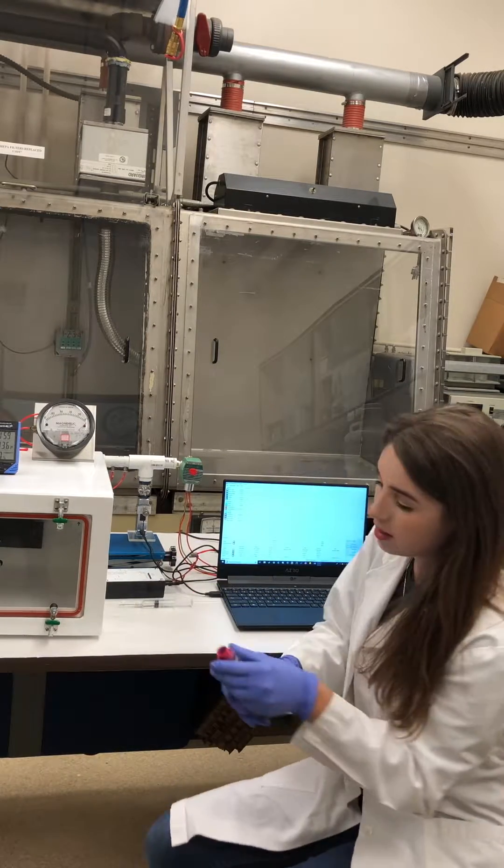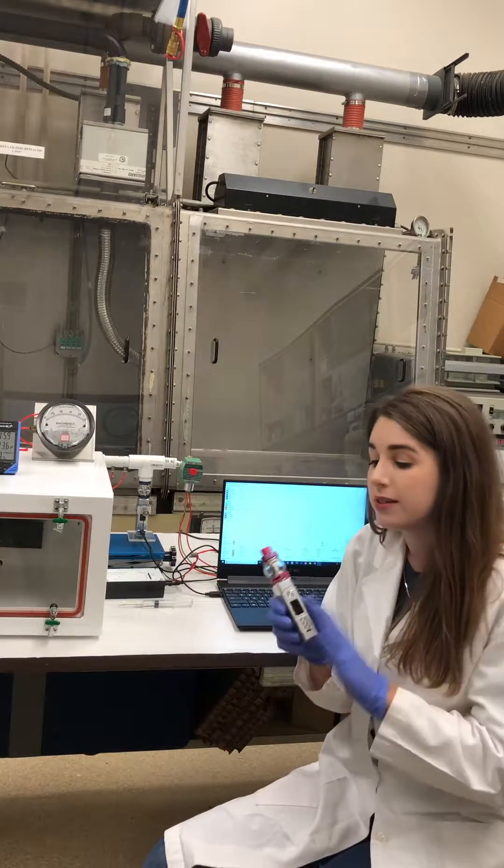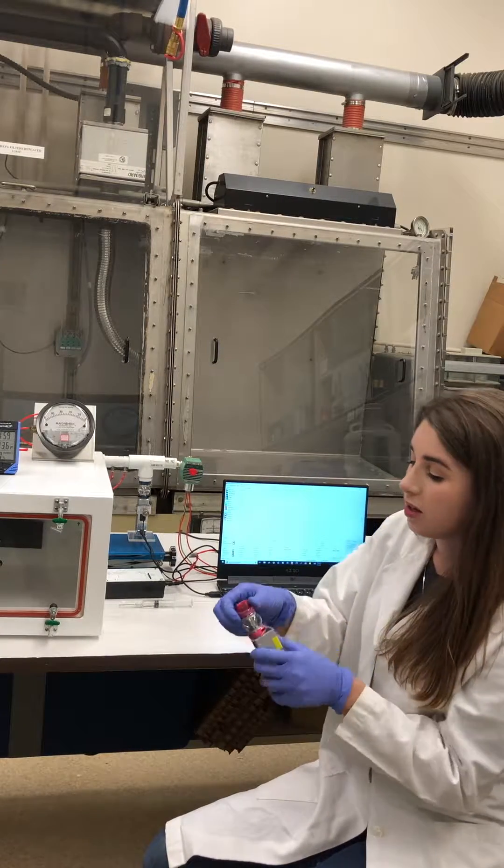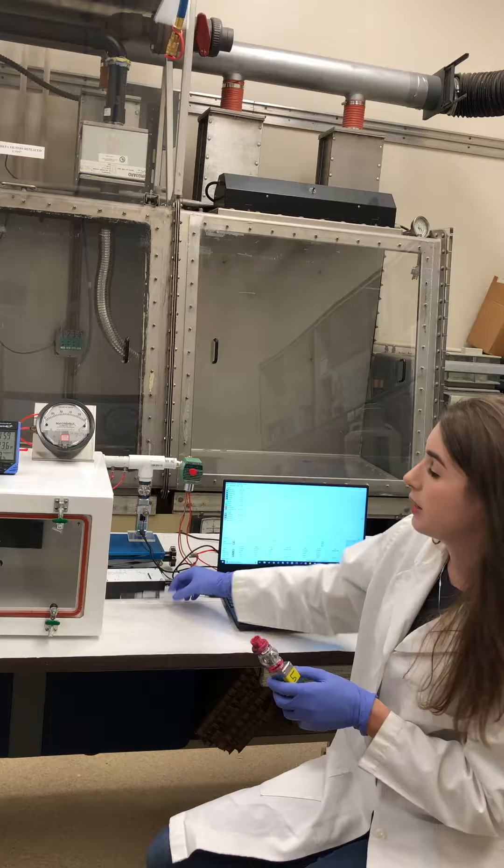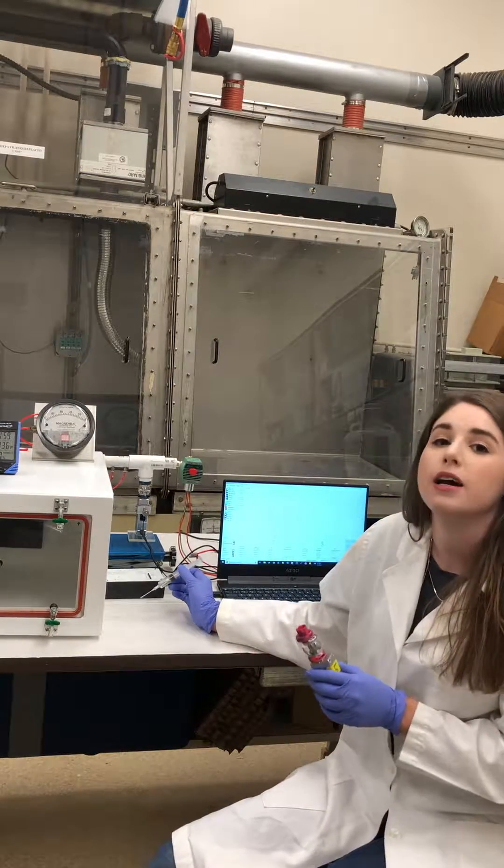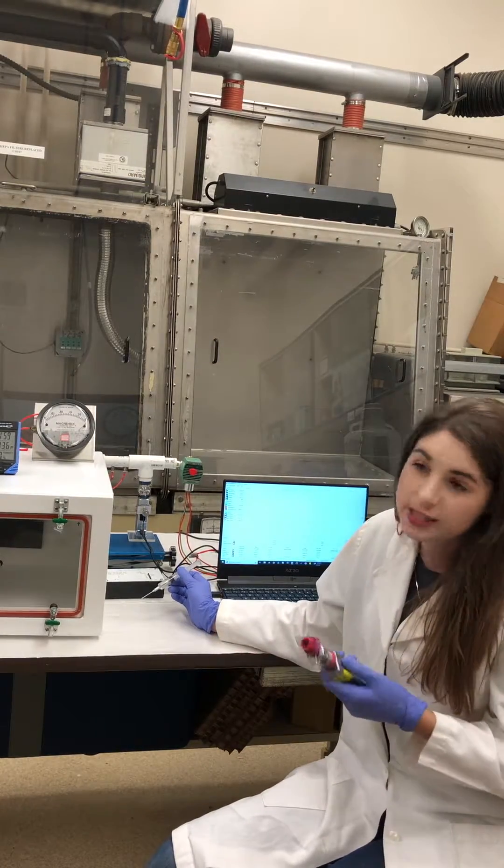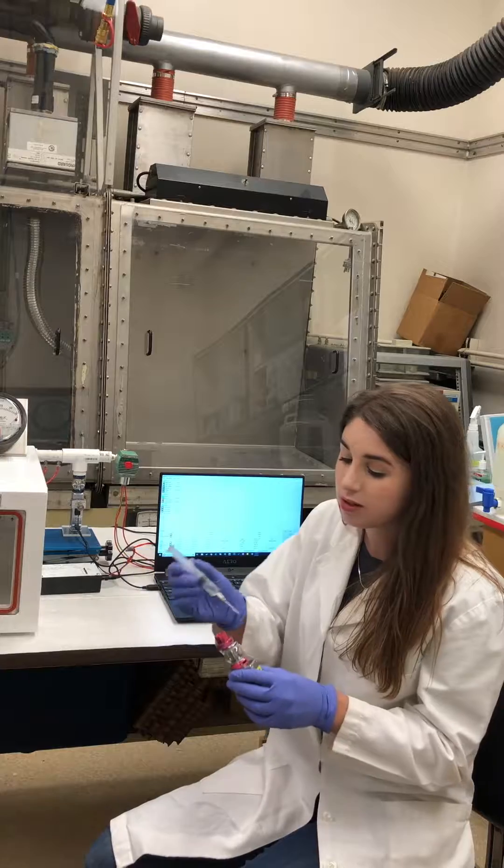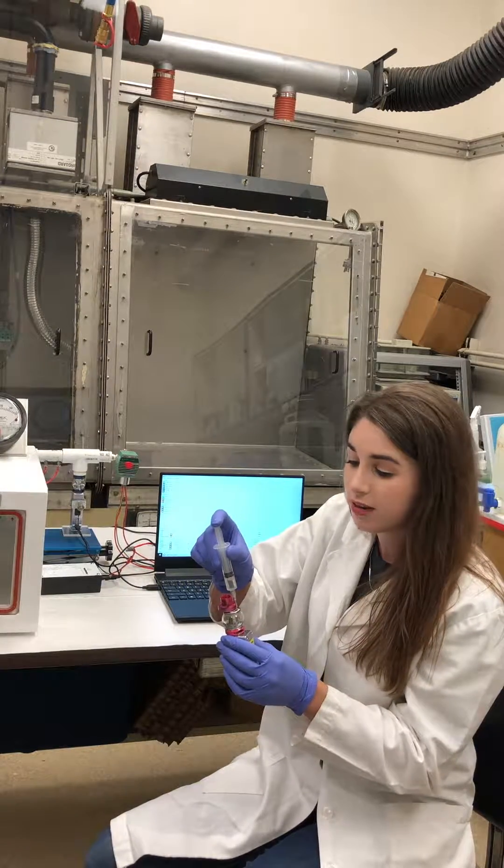So we have an e-cigarette device. It has a battery and then a tank where you put the e-liquid. We make our own e-liquid out of propylene glycol and vegetable glycerin, the same as you would purchase in a vape store. Then we add nicotine and we can add different flavoring chemicals. We just add that directly into the device.